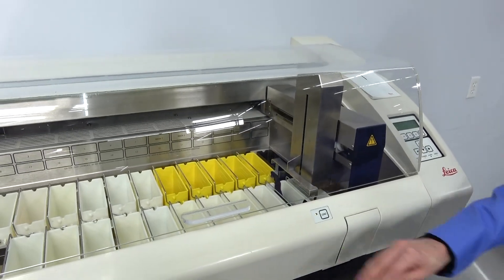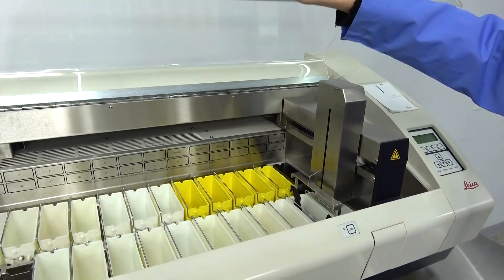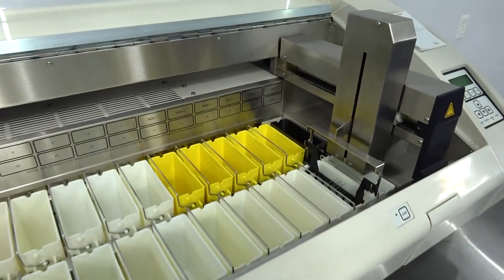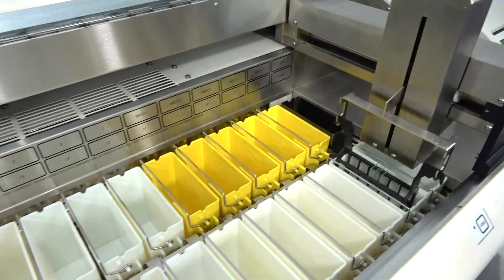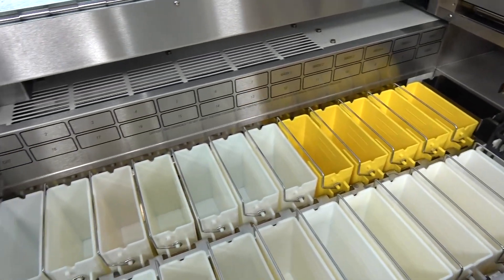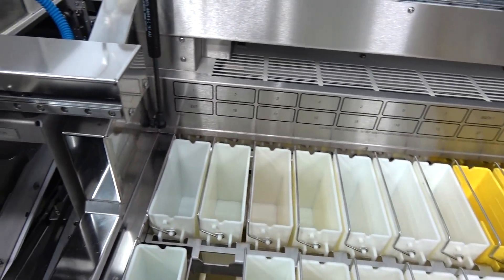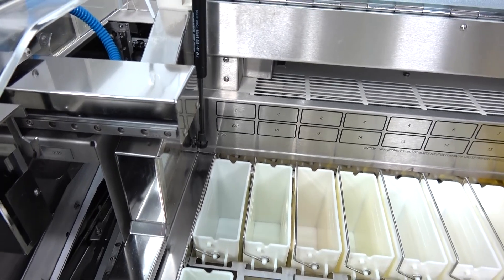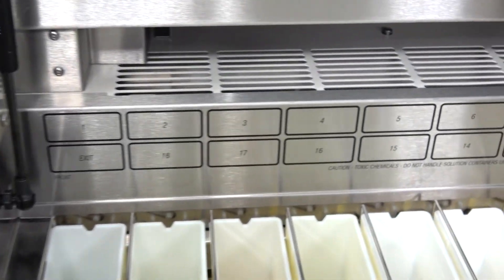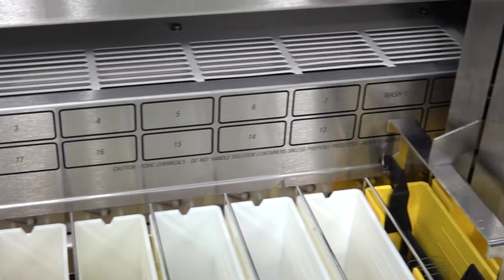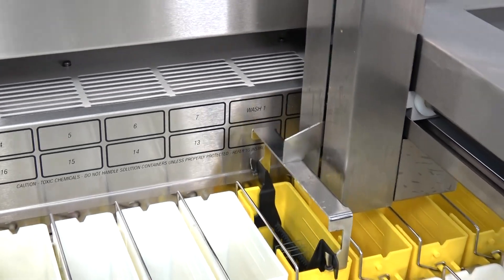You can see the inside of this machine is also very clean. It's been very well maintained, no scratches, no stains on it. What's nice about this as well is that the labels on the very back are very easily read, and you can distinguish which basket corresponds with the number.